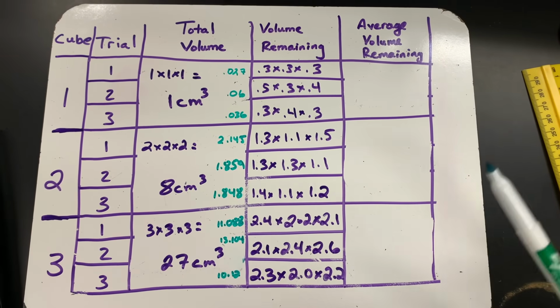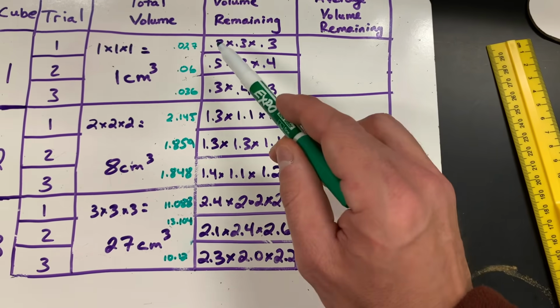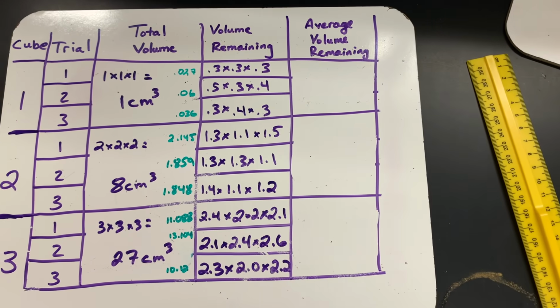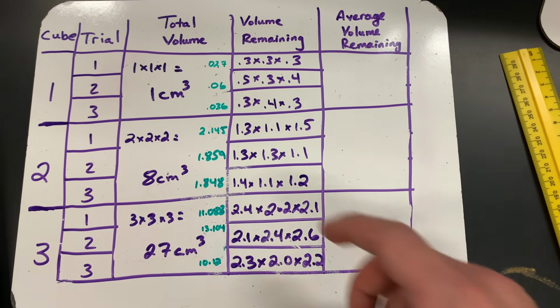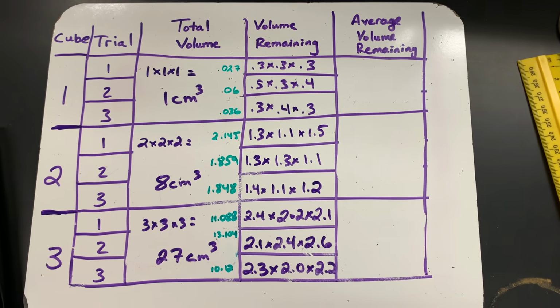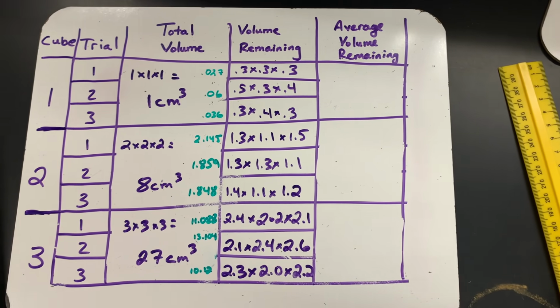But here's what I did here. In green, I wrote our volume of each one. So I multiplied these together and I got our volume. Why I did the 3 trials, guys, is so that I have good data. All these numbers are fairly close together here, which is good. We want them close together. If we have one that's a big outlier, something went wrong. But they're all fairly close to one another.